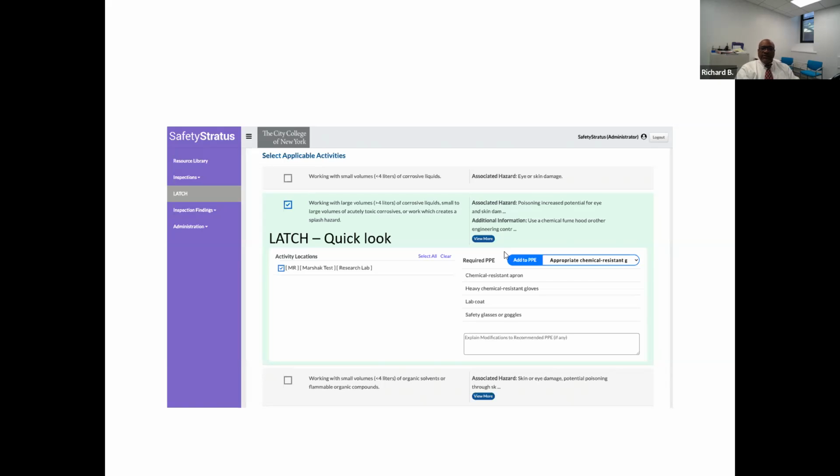But let's say, for instance, you're dealing with chemicals that are pyrophoric. Then it will be necessary to have gear that is more protective, fire resistant gear like Nomex suits if you're dealing with any pyrophoric material. The lab hazardous analysis is the tool that enables you to assess those hazards and come up with the necessary protective gear. Information necessary as to protective gear and hazards is located in the tool.